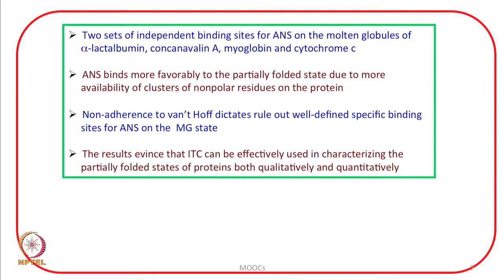The results from isothermal titration calorimetry certainly evince that ITC can be effectively used in characterizing the partially folded states of proteins, both qualitatively and quantitatively.